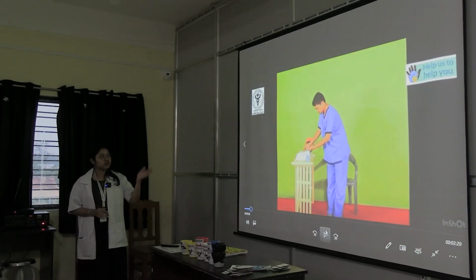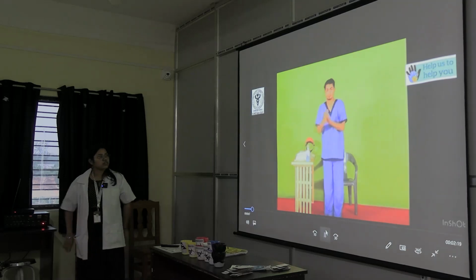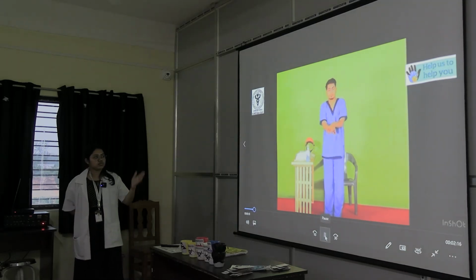So in this video you will be seeing he is doing all the steps of hand hygiene.